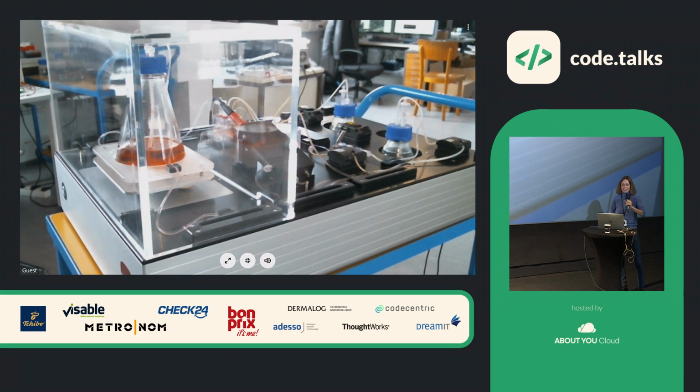Usually what happens now is that in some cases we are able to just ship the stuff and they can do it by themselves, but usually we need a Skype call to instruct them how to do it. This is something we are trying to improve, but it's definitely a goal. So it's possible, but you need a user who is not afraid of a screwdriver, so to say.